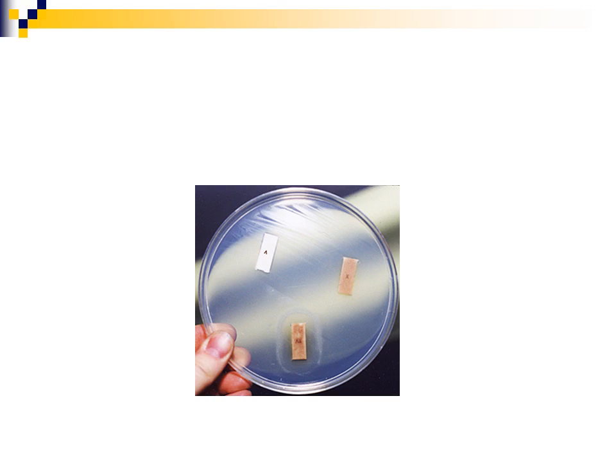Now, of course, you would do this on a general supportive or nutrient agar plate that doesn't have your hemin or NAD, doesn't have any blood source in it. So you want to really see, is this organism only growing around the NAD and hemin that you are supplying on that paper disc.